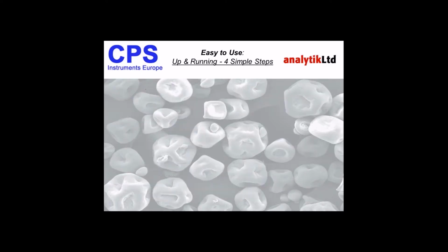Okay, so let's move on to how to prepare the instrument for analysis. The technique itself is very easy to set up and use, and we simply need to follow 4 simple steps. Number 1, we set the disk in motion at a constant speed, which is based on particle size and density.